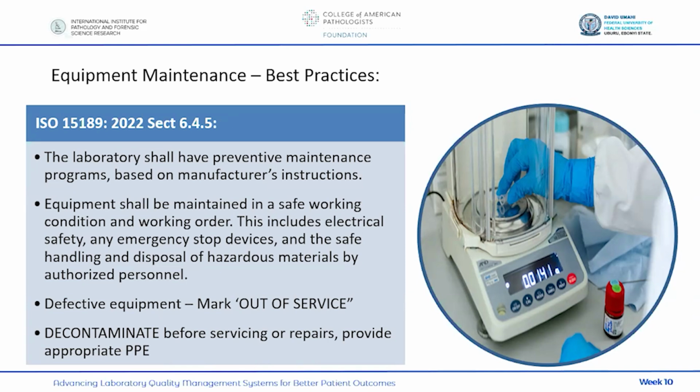If it's not clearly marked, another person may come and put it on and attempt to use it and may cause problems. So for any equipment in the laboratory, anybody that enters, any external agent, any external personnel that enters the staff should be able to know the functional equipment and non-functional equipment. So you need to mark any non-functional equipment out of service.